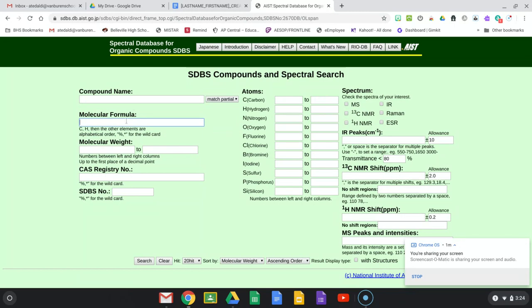Now, let's say you come up with your own formulas, right? Or you could just look at some of our other formulas that we've had in our practices. I'm going to make up a formula. Let's say I do C8H8O. I'm just going to make up that formula, all right? So I search, and you should get a bunch of results that have that molecular formula.